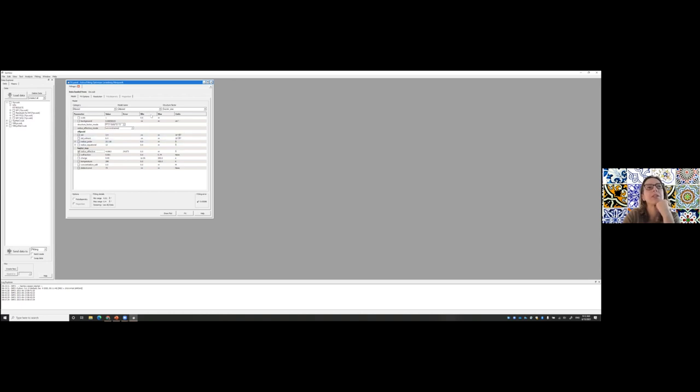Beyond these minimum and maximum values, in your step-by-step instructions, I give you an example. For this effective radius, I could tell it that I never want it to be smaller than, say, 2, and never bigger than 100. I could set that here and do the fit, and it will constrain it between these two values. So the short answer is yes, you can constrain not only within one model, but also between different data sets. Here I'm just showing you a very general example to give you a more intuitive feeling of how it works, but it's powerful software with many options.